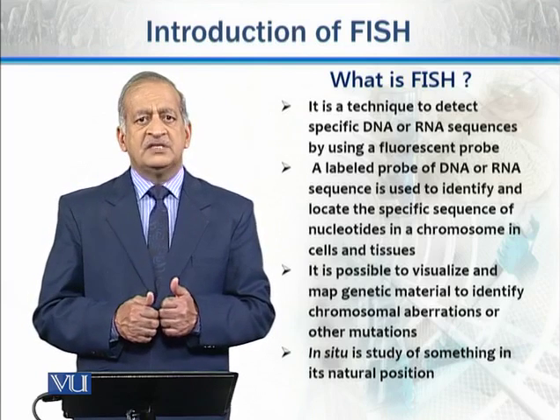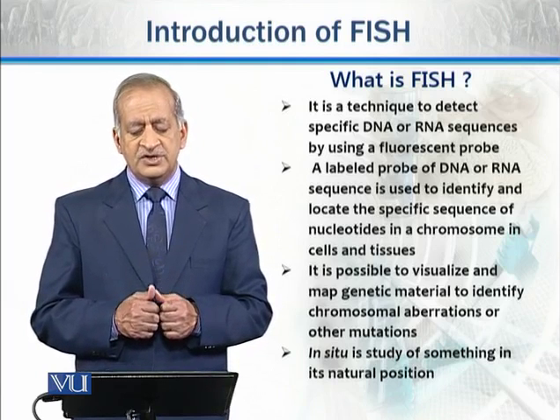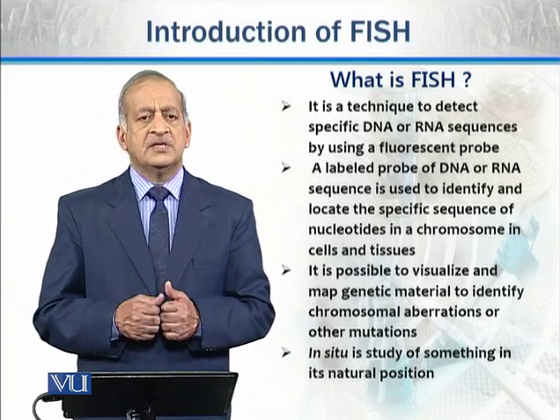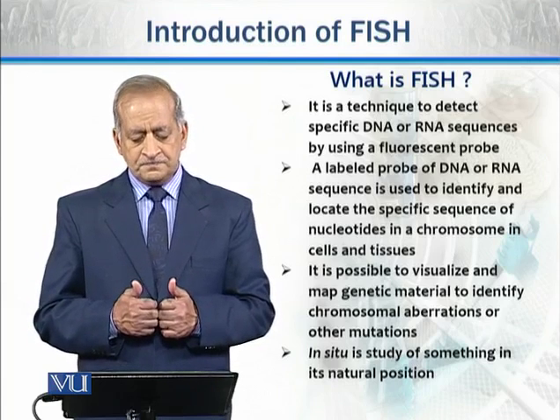With this technique, it is possible to visualize and map genetic material to identify chromosomal aberrations, other changes or mutations present in genetic material of that organism.